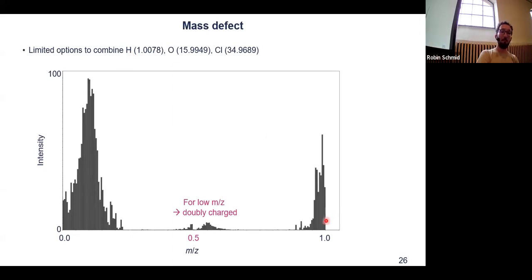And then on the minus side, I would say 0.9 point something, on the right side, you have all the ones that have very little hydrogen and a lot of heteroatoms. And in the center, most likely at m/z 200, it's just doubly charged ions. There's no other way to get to 0.5 in 200 m/z.